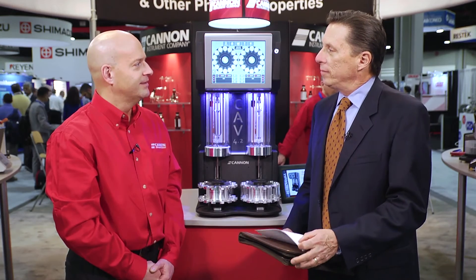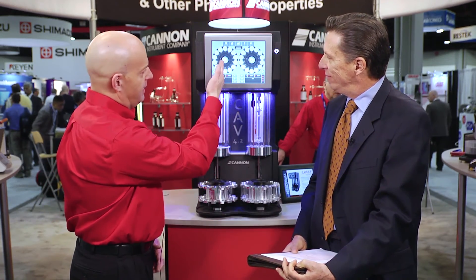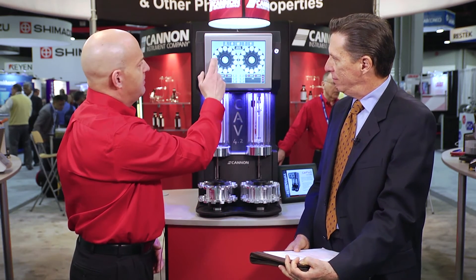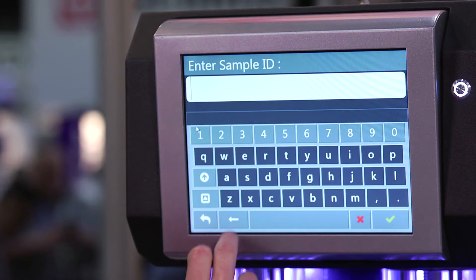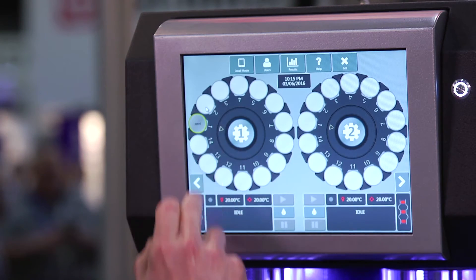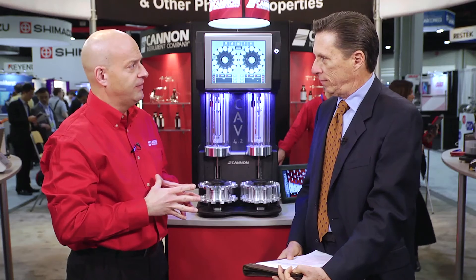How easy is it to run a sample? It's very simple. Based on the display here, we have the left sample changer and the right sample changer. To enter a sample ID, you just simply pick the position and type in the sample ID. On this particular system, we have it set to a default test method.